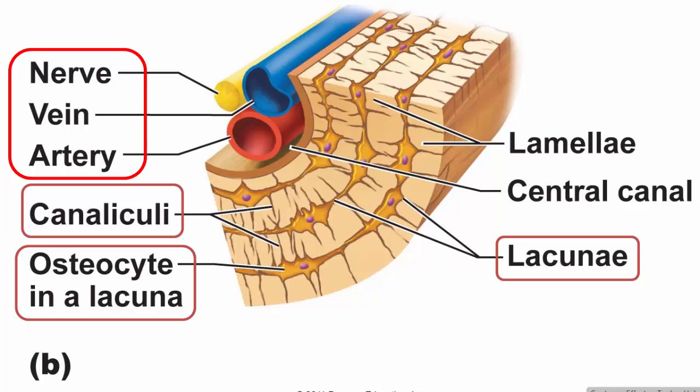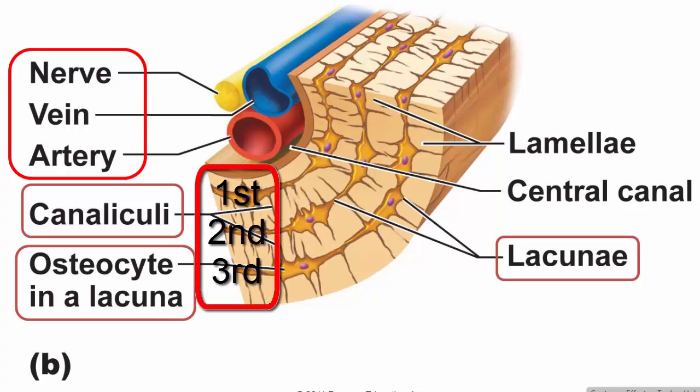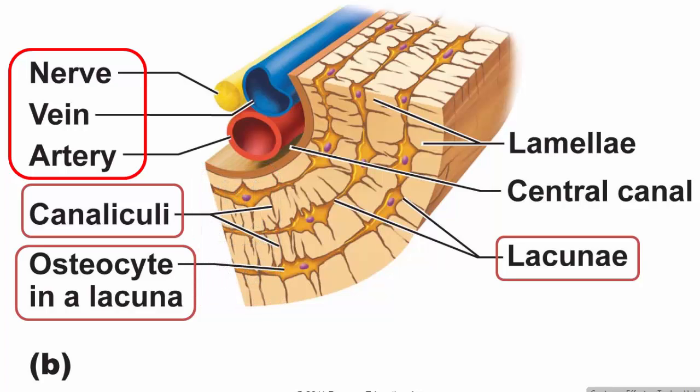So we just cut a quarter of one of the osteons, or the building blocks of bones. Now in the osteon we have lamellae. So this is one lamella, second lamella, third lamella. These lamellae are made by lacunae that are connected to each other. So this is a lacuna. Here is another lacuna here. There's a third lacuna here. Inside these lacunae, you have the osteocytes.